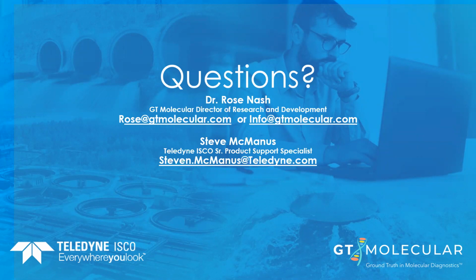But generally, when people reach out to us, our first point is to help them think about how to set up a sampling plan, put them in touch with ISCO, and then once they have that up and running, we ship you kits and you ship them back to us, and then we provide you data.